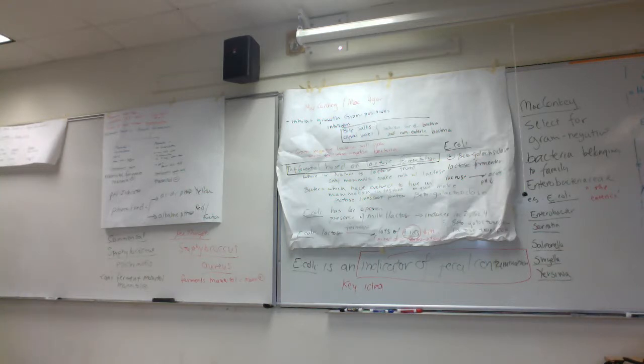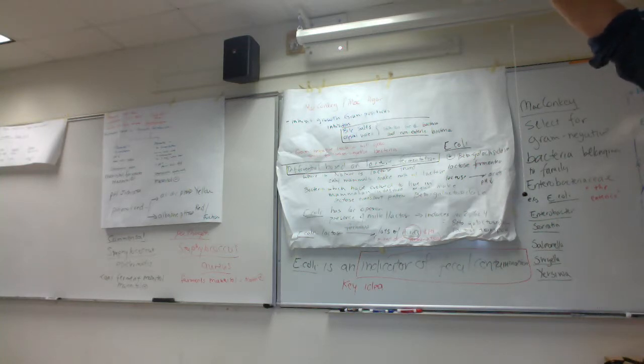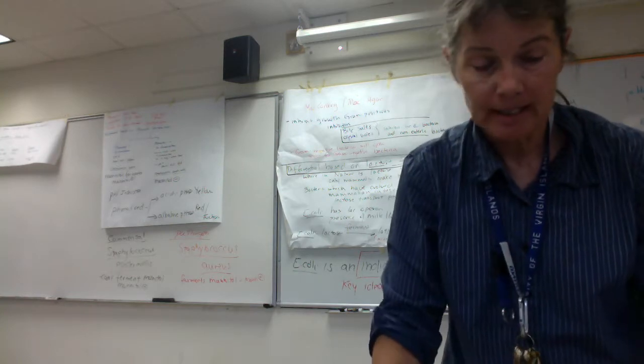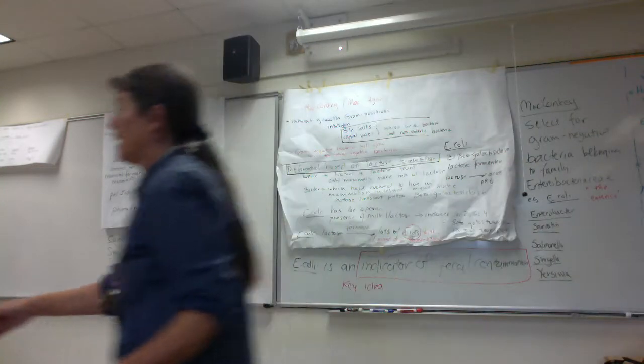Good job, you guys. All right, and then what we'll do, folks, is I'll move the blood agar plates, and you guys, again, don't open these. You can hold them up to the light to see the awesome alpha and beta hemolysis, and then truly, you guys, just wash your hands afterwards. We'll put the blood agar plates over here with our blood agar concept map. And then here, with the MacConkey's, let me clear a space, and we'll put our MacConkey demo plates up here for you to take a peek at.